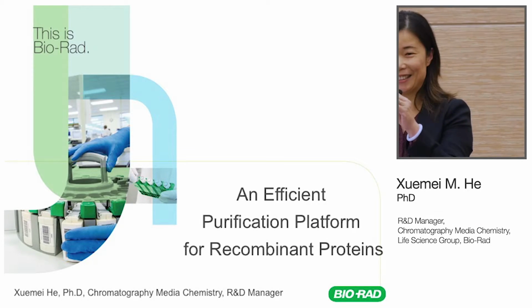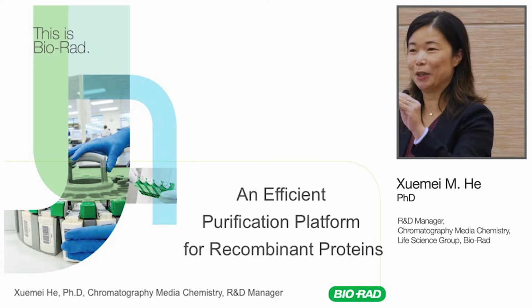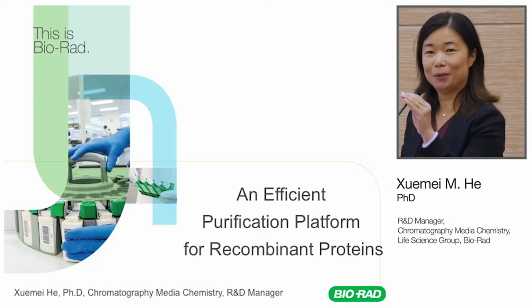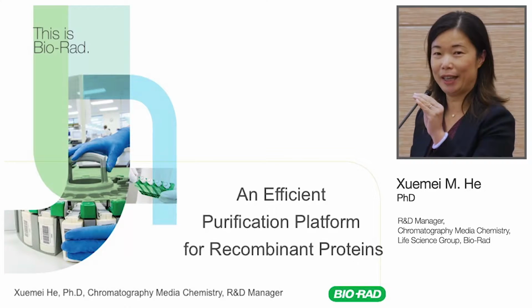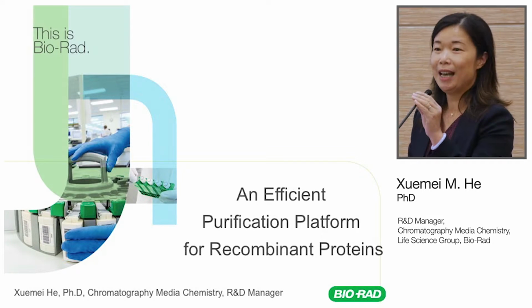First, I would like to thank the organizer for giving us the opportunity to talk about a new resin, Nuvia IMAC, and also how we use this for the purification of bacterial proteins. And we try to build a purification platform.